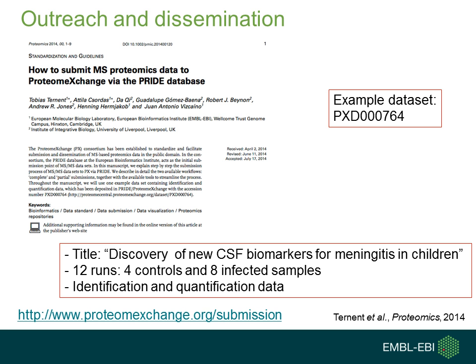Okay, I think we also published a kind of instructions manual how to submit to ProteomeXchange, just to have it easy and have the whole process outlined for users.